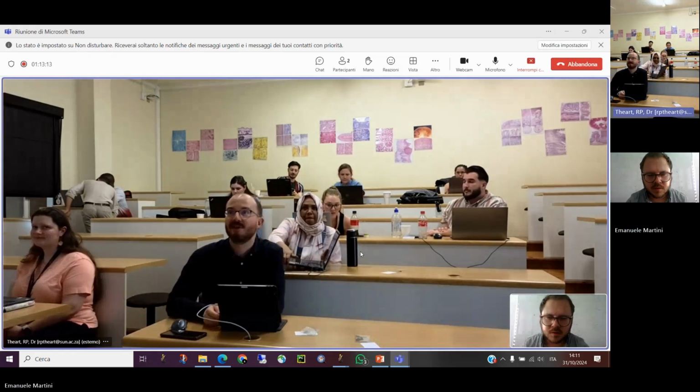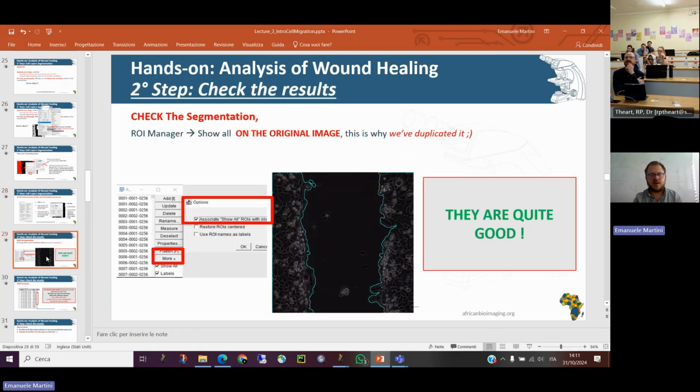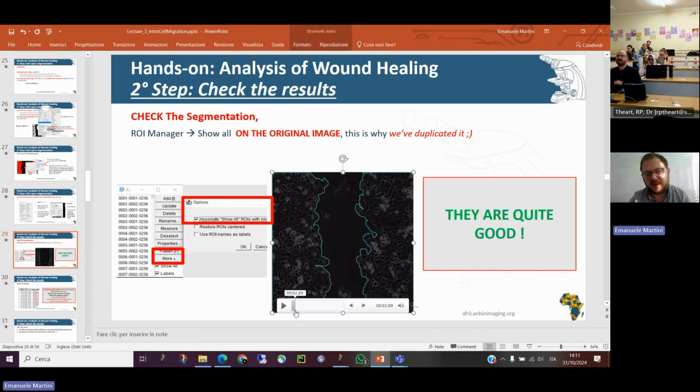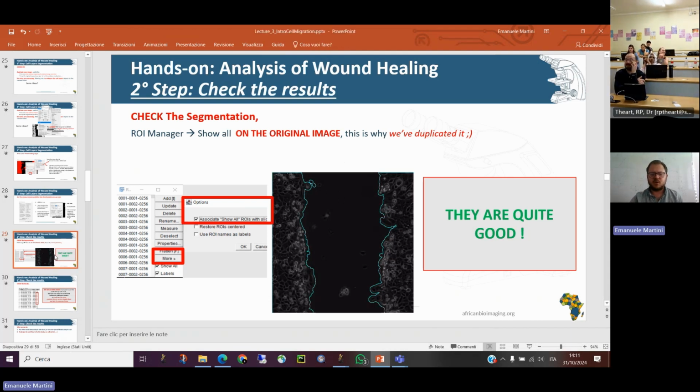Okay, Leonard, I think you can carry on. Most people seem to be sorted right now. Okay, we carry on. Imagine that I'm not here and you are alone, performing and analyzing this experiment for the first time. What do you do? First of all, you check if the segmentation, the recognition, is okay. In our case, it seems very good. We are able to really find the boundaries of our cell layers. The second thing you check is the results.